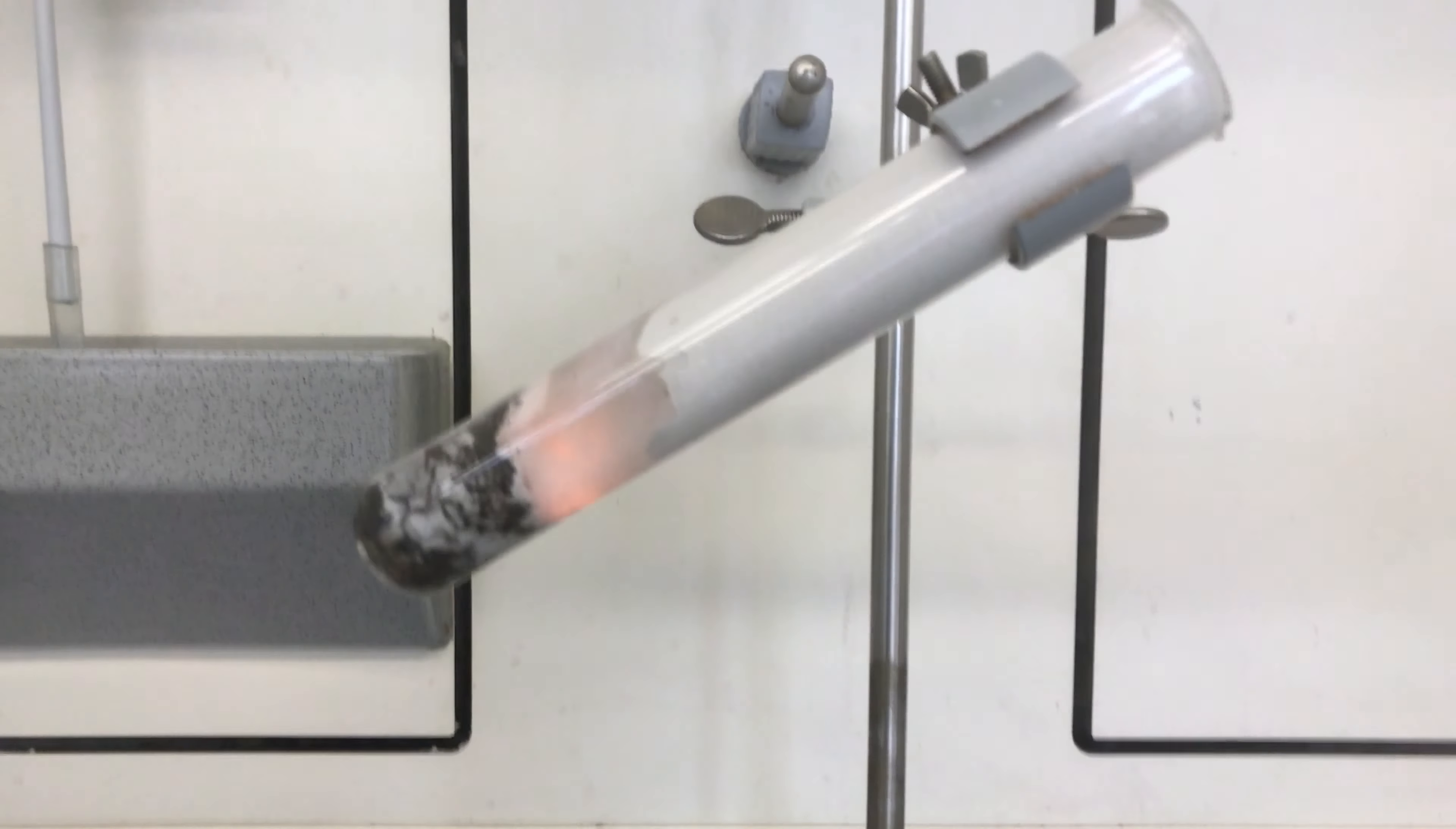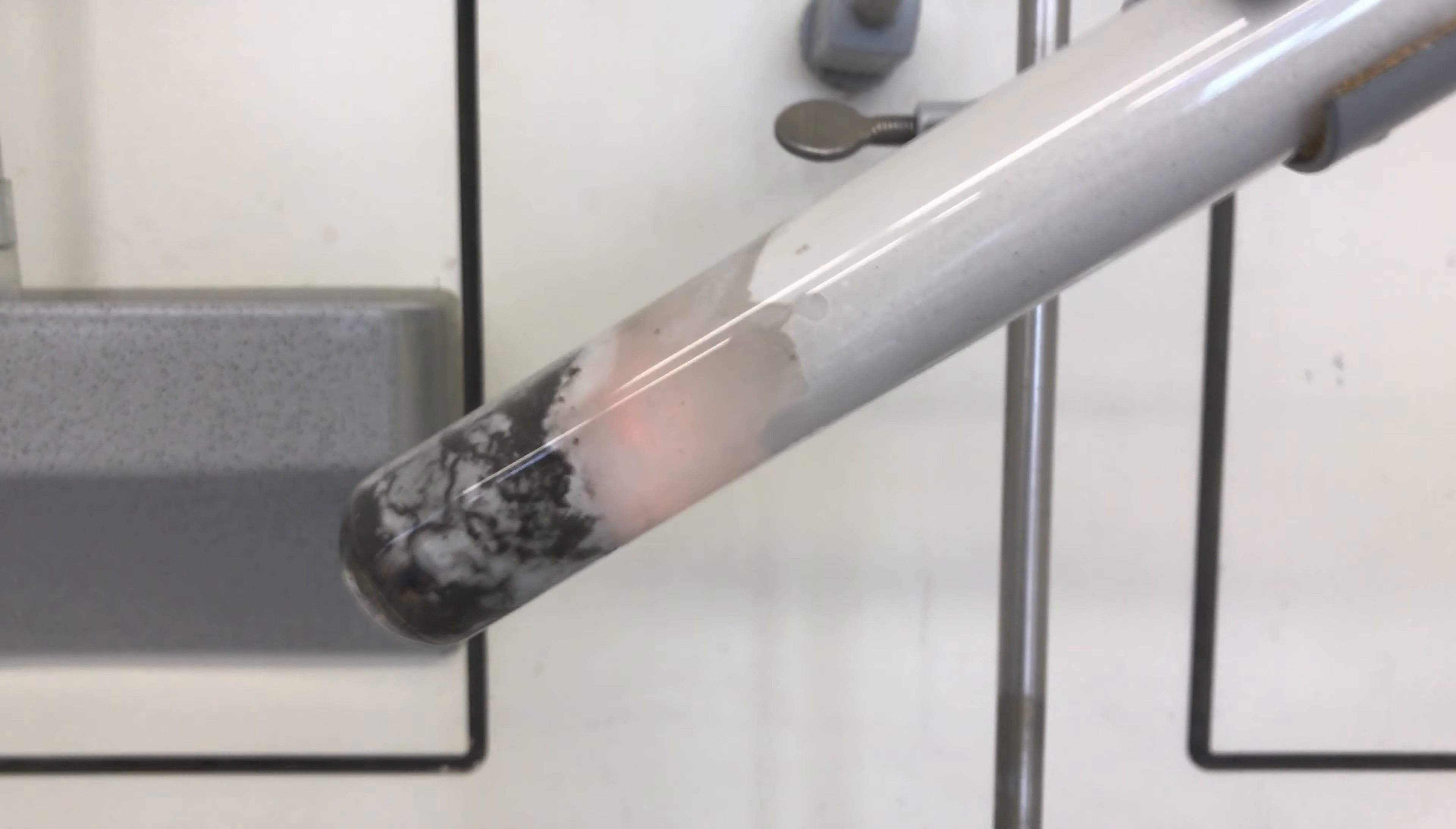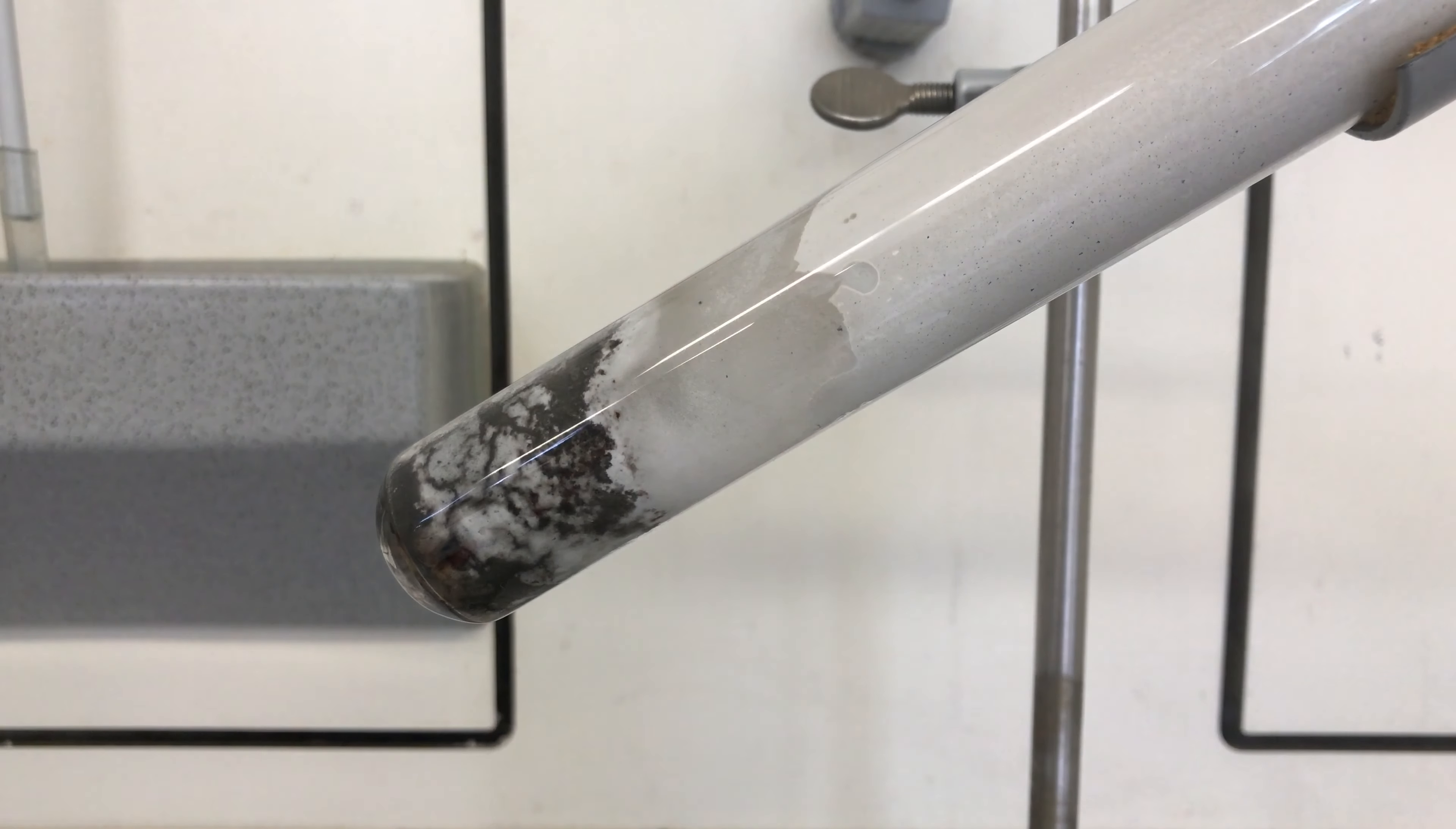Potassium chlorate as an oxidizing agent releases oxygen and makes the gummy bear burn. Potassium chlorate in return is turned into potassium chloride.